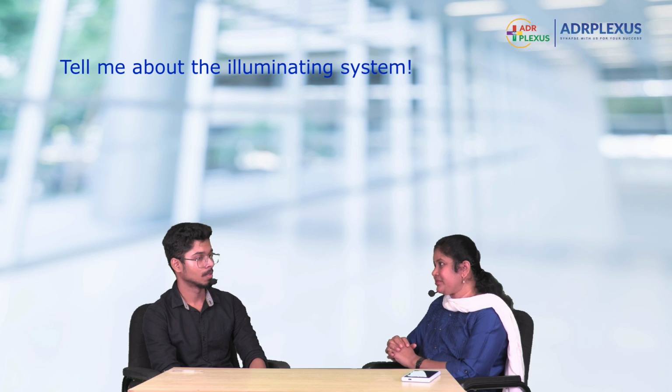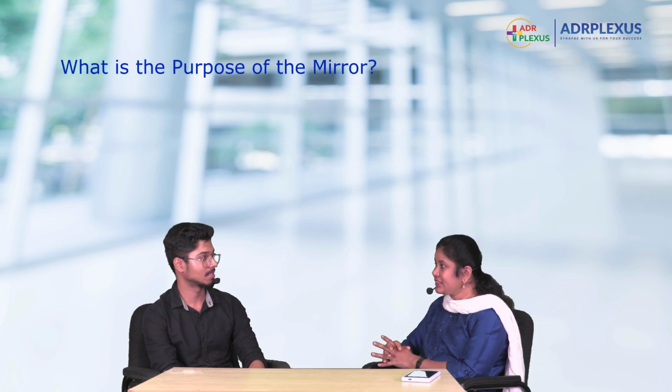What does x mean here? Magnification. Yes, that many times the magnification, 4 times the magnification of the object. Okay, fine. Tell me about the illuminating system. In the illuminating system, we have either an inbuilt light or an external source of light, and we have the mirrors, that is the concave mirror or plane mirror. What is the purpose of the mirror? It reflects the light, ma'am.